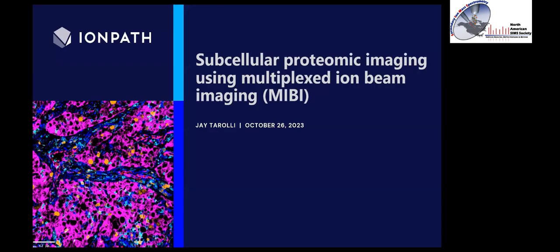Proteomic imaging using our ToF-SIMS system, which we commercialize and call multiplexed ion beam imaging, or MIBI.